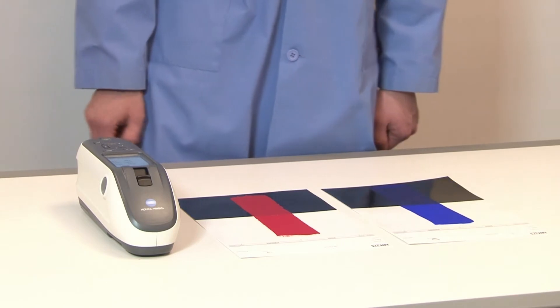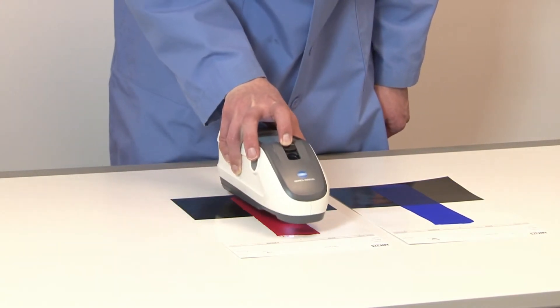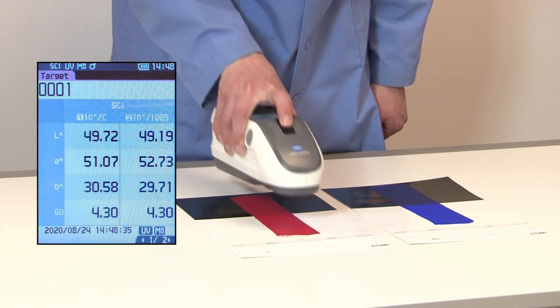After calibration, your instrument is ready to use. If you have an established standard, you can place the unit in target mode, measure the object, and it will then be loaded into the instrument.